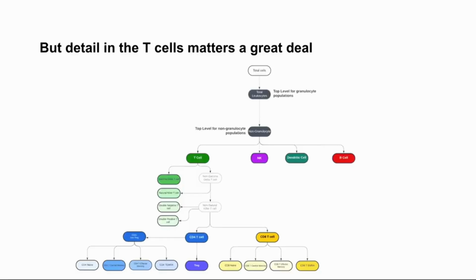And this is our argument, which is that if you look at the T cells, if this person is developing a drug that actually goes down into the details of the T cells, like CD4, CD8, or potentially memory types within the CD8 T cells, this scientist might be missing a lot by just focusing on T cells alone and not seeing the individual details.